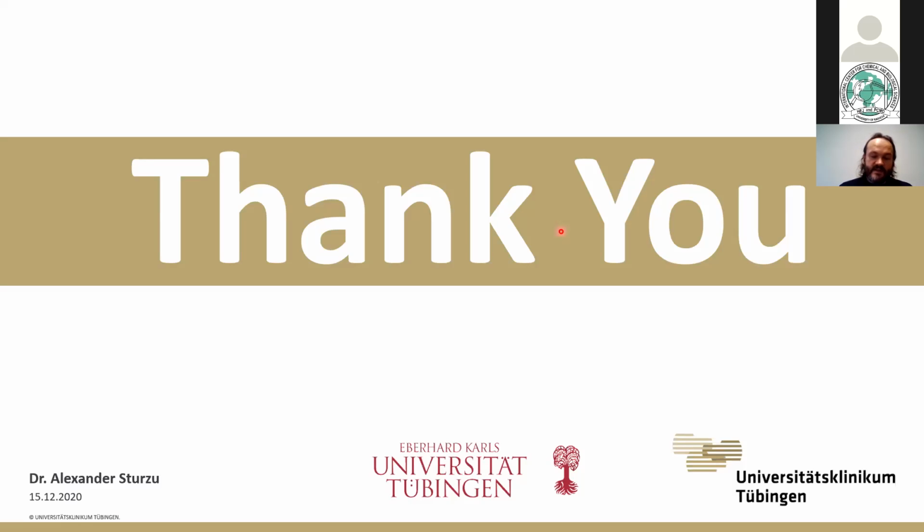So you have to necessarily do, let's say, a medium change. You have to add solvent. Okay. So it's just additional work steps. This is why the XTT is much more user-friendly. It saves the scientists work because they can just add the XTT to the existing sample and leave it there for 2-3 hours and then immediately go measure the results. Other than that, they're exactly the same experiment.